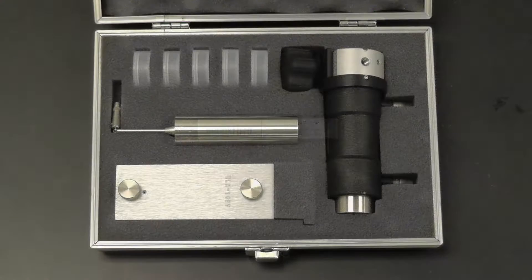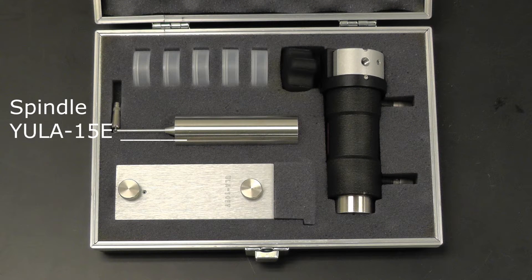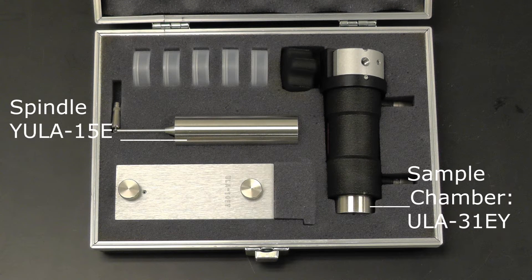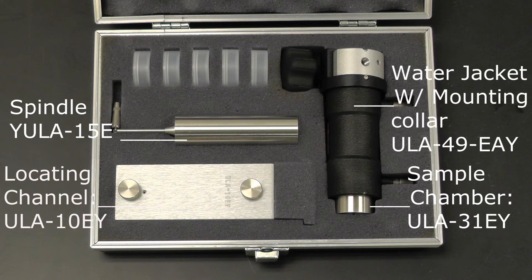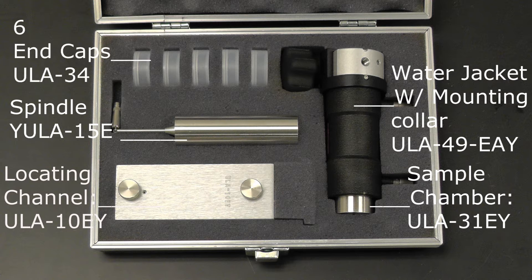The UL adapter consists of one large spindle, one sample chamber, a locating channel, a water jacket with mounting collar, and six end caps.